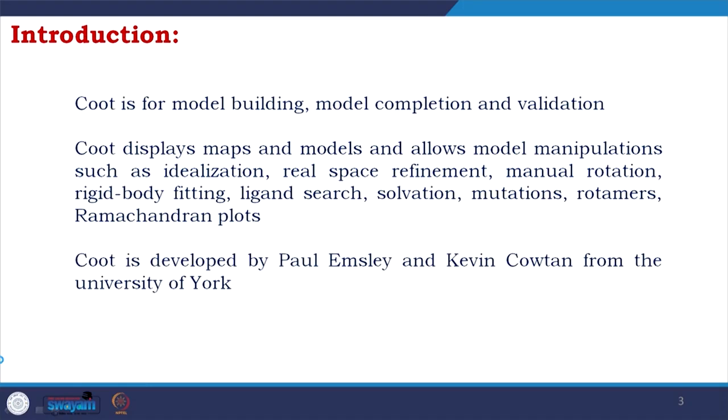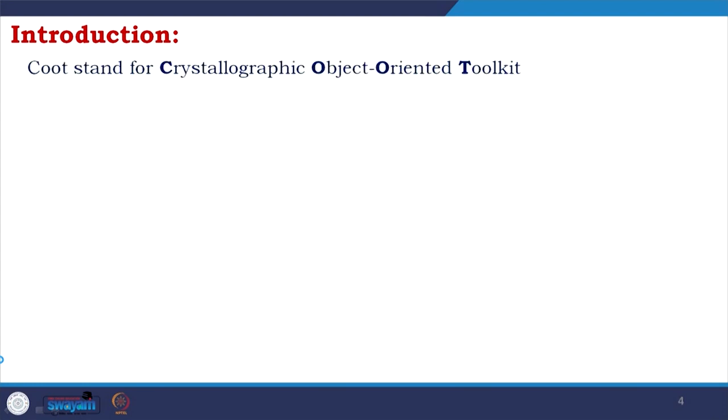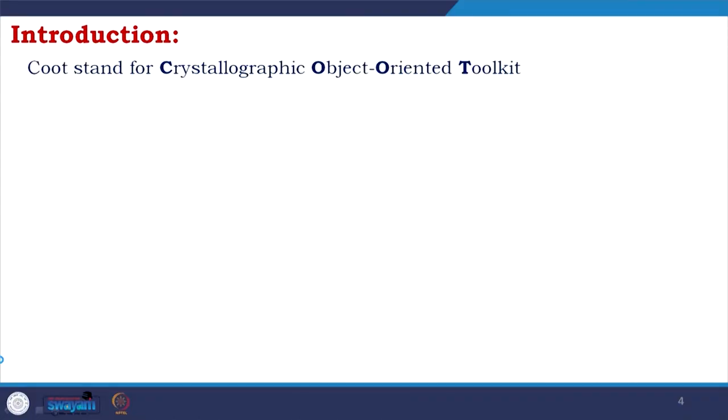Coot is developed by Paul Emsley and Kevin Cowtan from the University of York. Coot is the name of a small bird which I have shown in the introductory slide, but why the name Coot? Because Coot stands for Crystallographic Object-Oriented Toolkit.